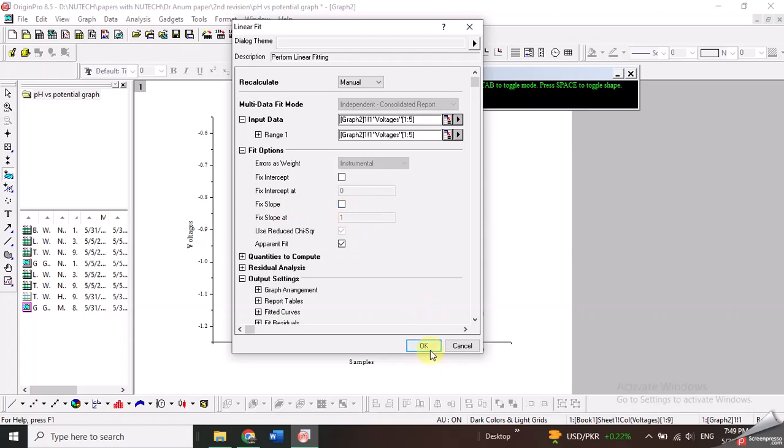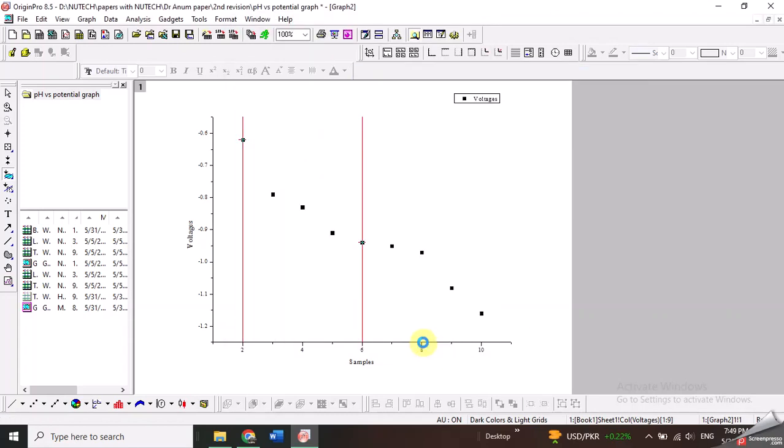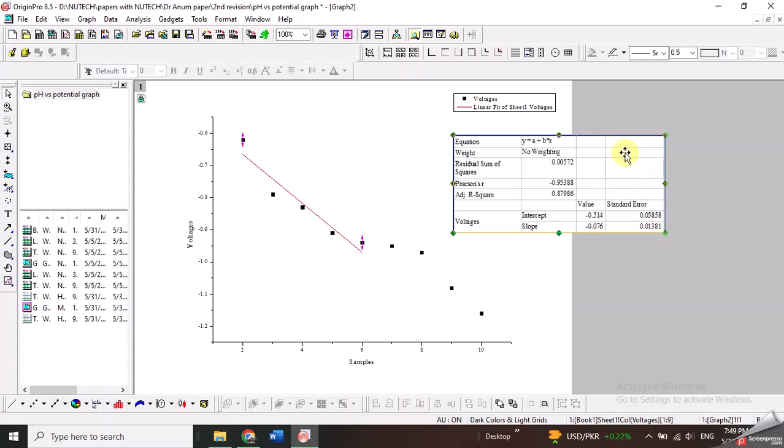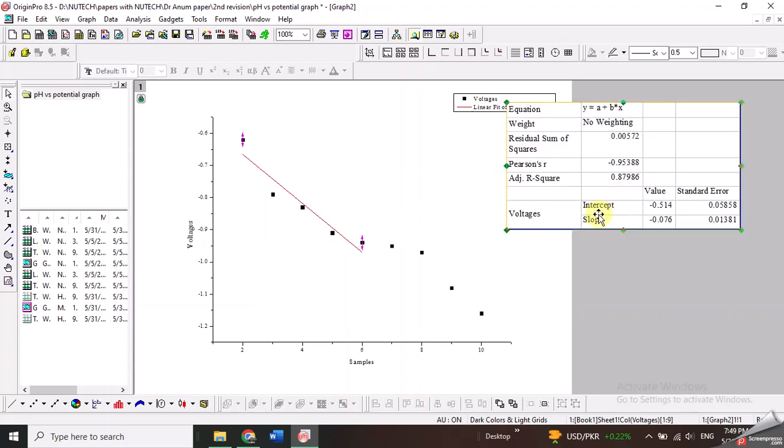So I will just click OK. Once I click OK, the linear straight line is fitted, and you can see this box which shows the value of the intercept and the slope for this straight line. You can use these values for further calculations as required.